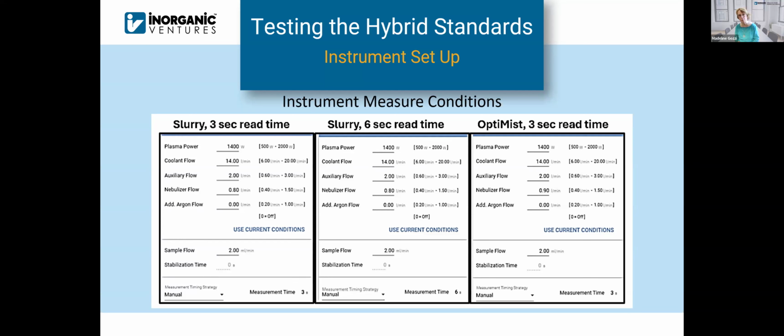In oils testing labs, they are looking at extremely high sample throughput. Probably hundreds of samples each day need to be analyzed. So our goal in setting up the ICP-OES method was to get the best possible results with the minimum time per sample. We've seen time per sample from 1.5 minutes per sample all the way down, with specialized instrument setups, to 20 seconds per sample.